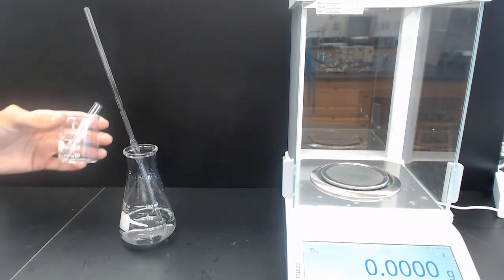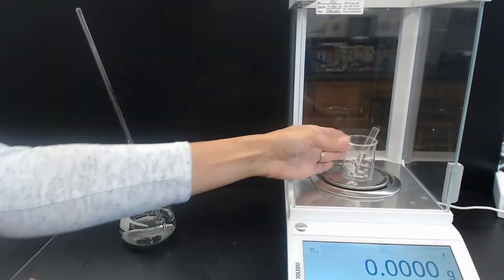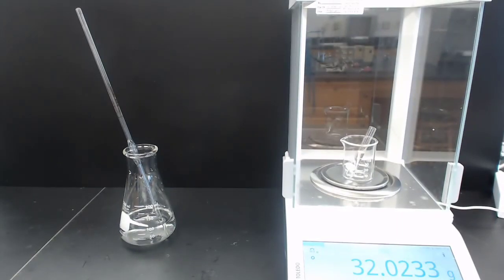Now we have 2 milliliters in our small test tube. We'll place this back onto the scale, and we'll record this mass value for the mass of the test tube, beaker, and water for trial 1. And then we can subtract to get the mass of the water alone, and we'll be able to divide and find our density of liquid.